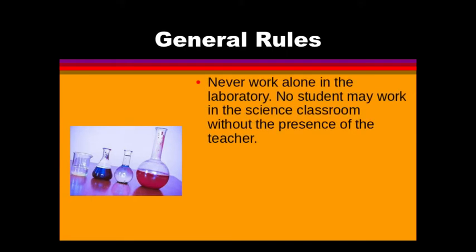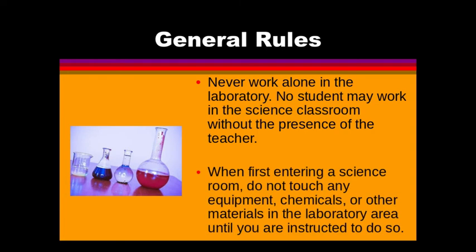Okay? Never work alone in the lab. No student can work in the science classroom without the presence of a teacher. So if I'm out in the hallway talking, whatever I'm doing, you may not start that lab until I've instructed you to do so.